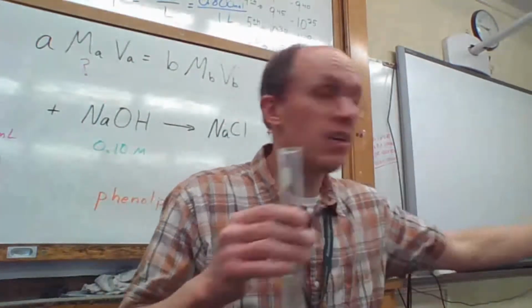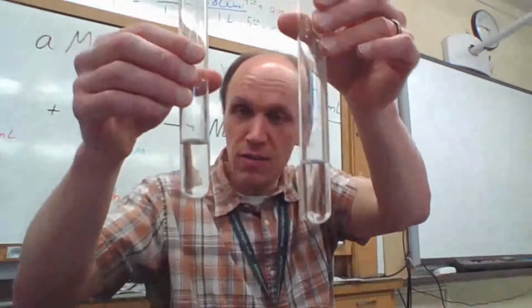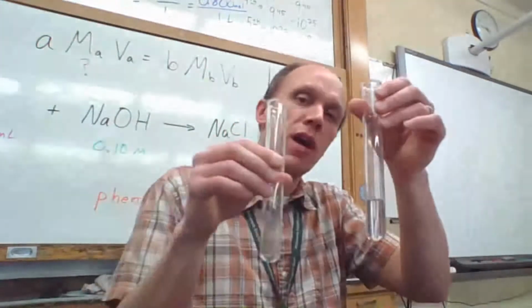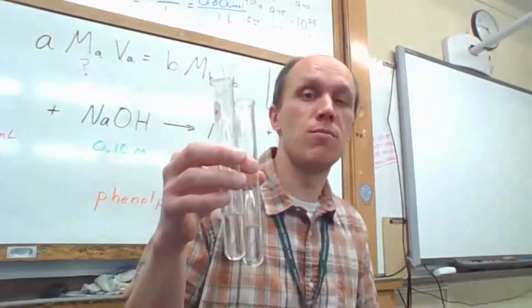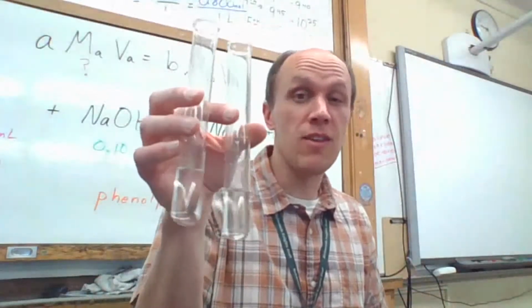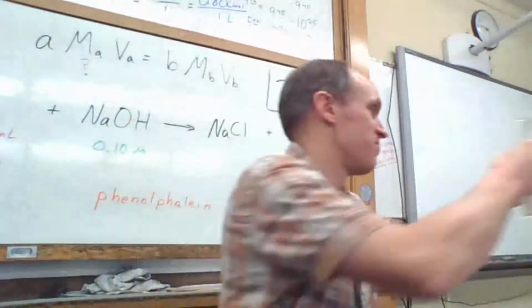The solutions we'll be mixing together, and I'll just switch camera angles and show you in a second, are two relatively colorless solutions, one of potassium iodide and one of lead 2 nitrate. We're going to combine these solutions. They're going to make a precipitate. Then we're going to filter out that precipitate and let it dry for a couple days, although I started that a couple days previous to now so that we can just get it all in one video. And then you can play around with the stoichiometry and the math and see that this stoichiometry stuff we're doing is actually a real thing.